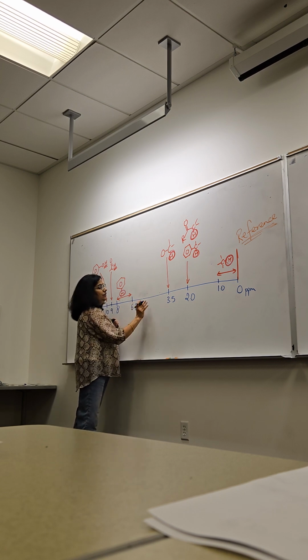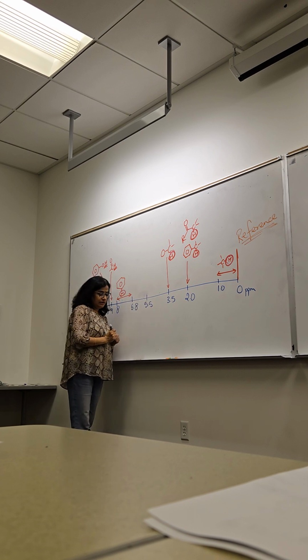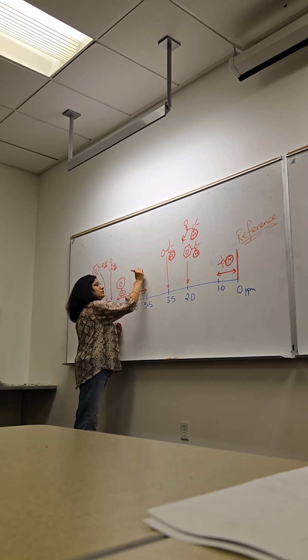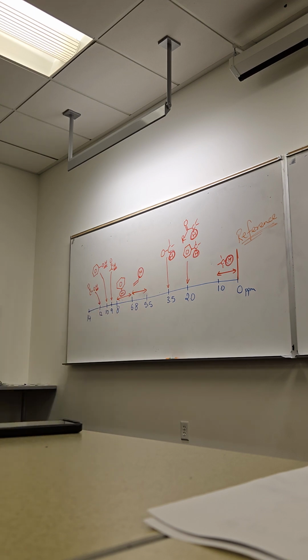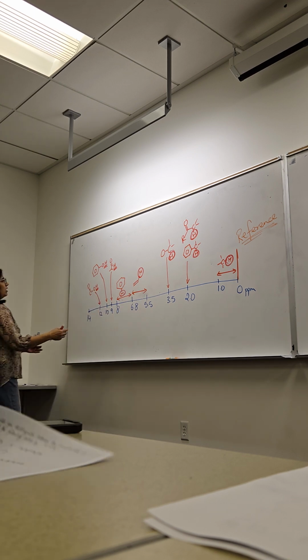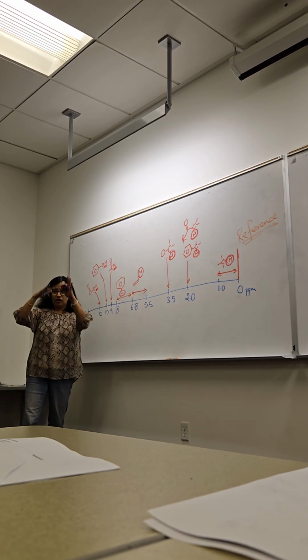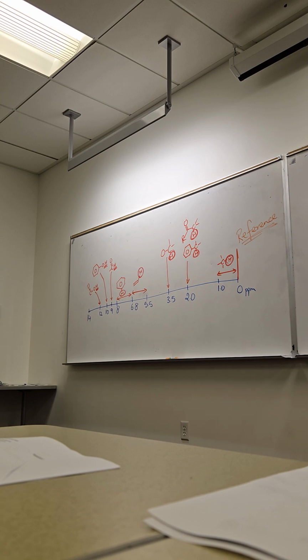The vinylic hydrogens can be anywhere from, again, these are approximate ranges, please remember that. This region is where vinylic hydrogens show up, meaning hydrogens that are on an alkene. So notice in proton NMR, benzene and vinylic are different ranges, although sometimes depending on other groups they may overlap a little bit, but they are expected to be different.